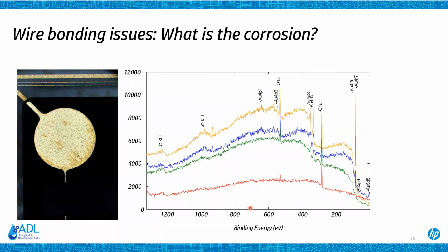In these different areas, the inelastic background changes rather drastically. It's a nice illustration of what happens to the background when you change the thickness of a layer. In fact, the red one here is a very thick area, and the orange one is the thinnest of all of these. And so in this case, the background is actually moving back down as you add thickness.